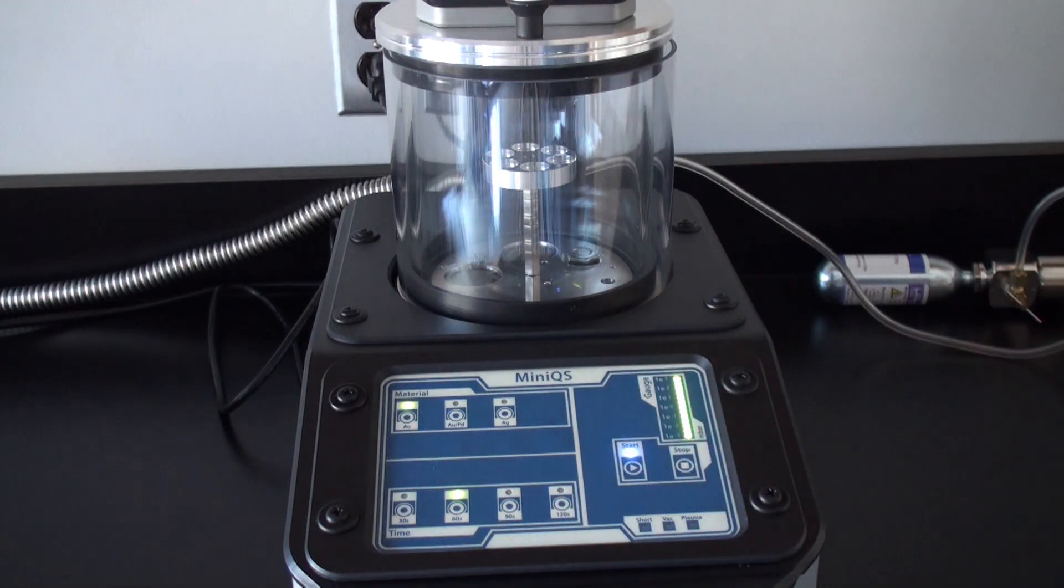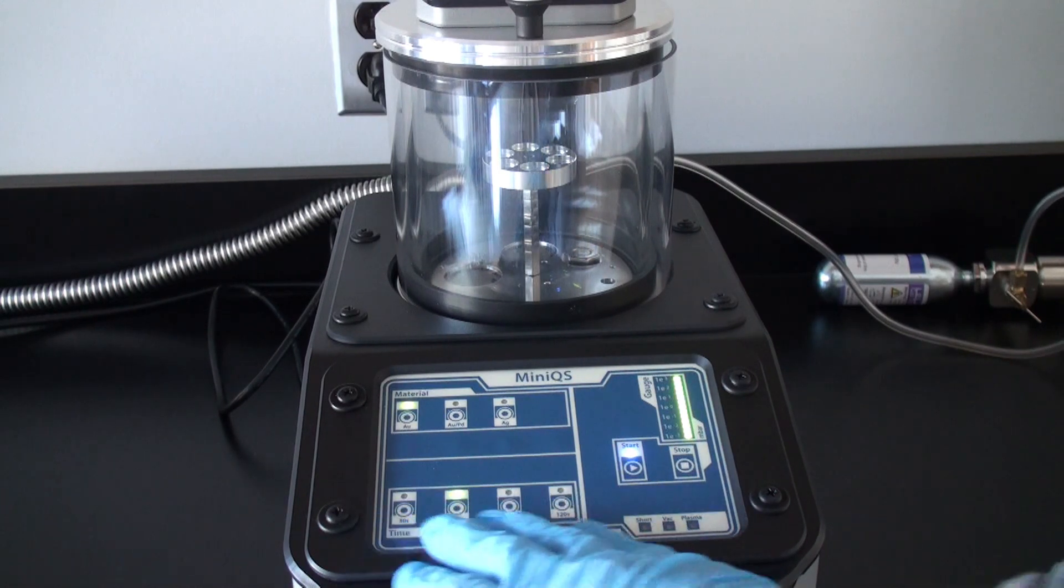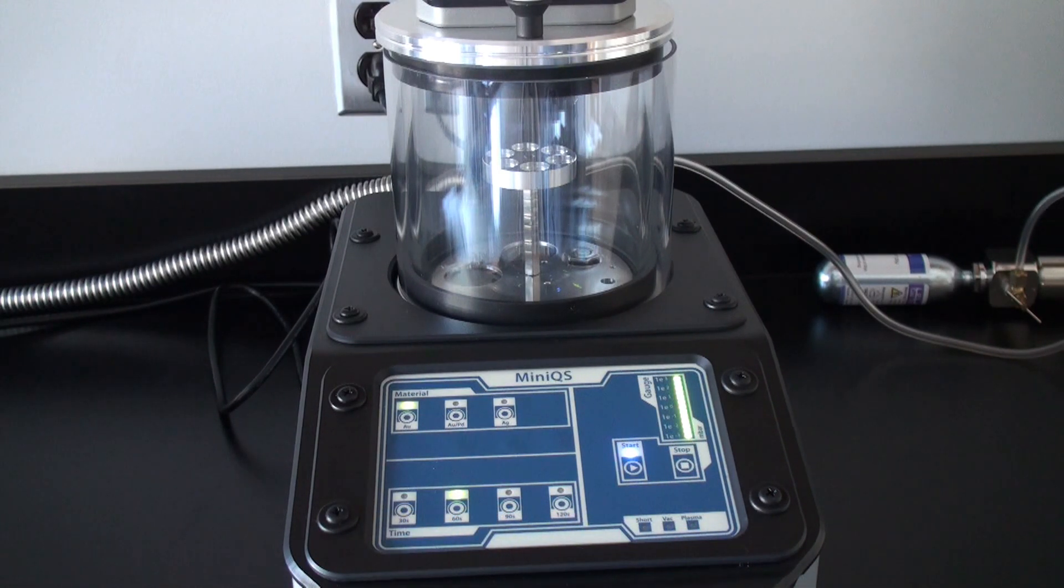It's compact, it's just the right tool for your tabletop SEM. It allows you some versatility of three different metals, four different time intervals, and in the manual there's charts that will tell you approximately at different time intervals how much coating has taken place. Thanks for your attention.